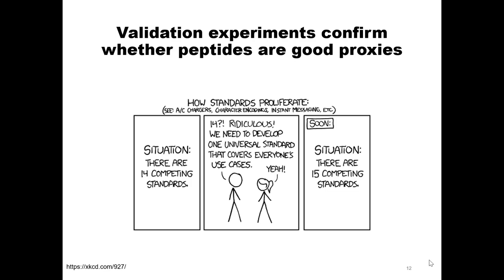So I'm about to unload upon you a lot of people's various opinions for what experiments are important to do. And I think my best advice to you is to decide for yourself which of these validations are best for your experiments. Like I said before, for a clinical experiment that's actually going to be used for patient samples, maybe you want to be more rigorous. If you're doing some biological perturbation experiment and you have maybe thousands and thousands of targets, say for your PhD thesis, maybe not all of these are appropriate for you.